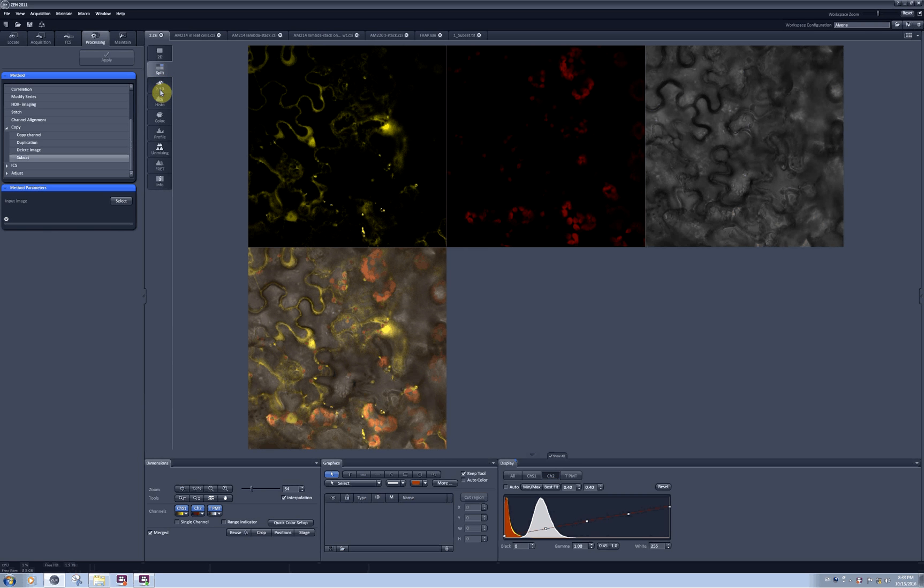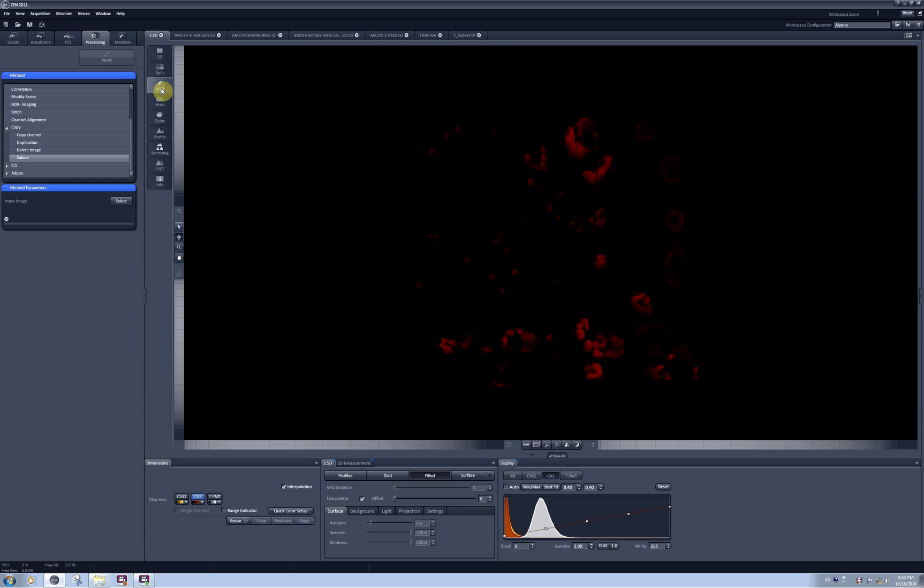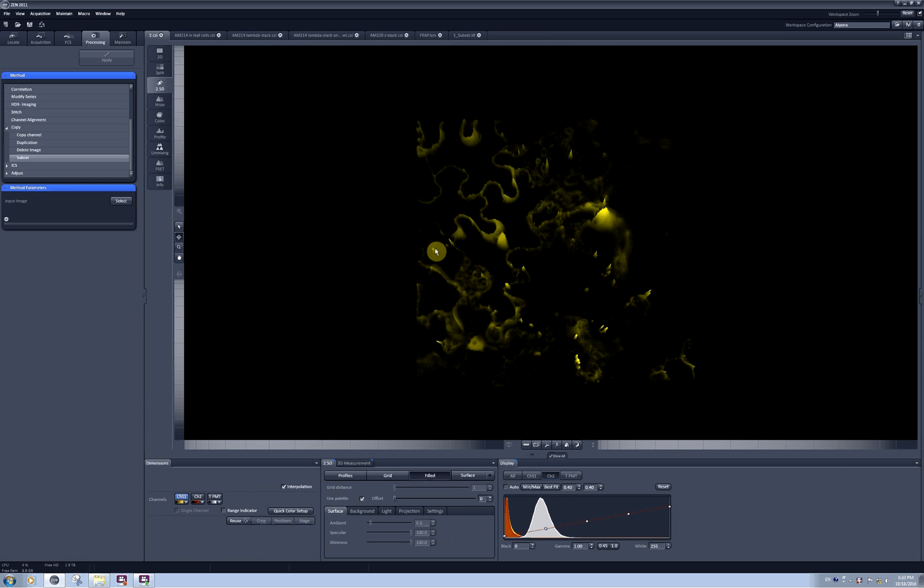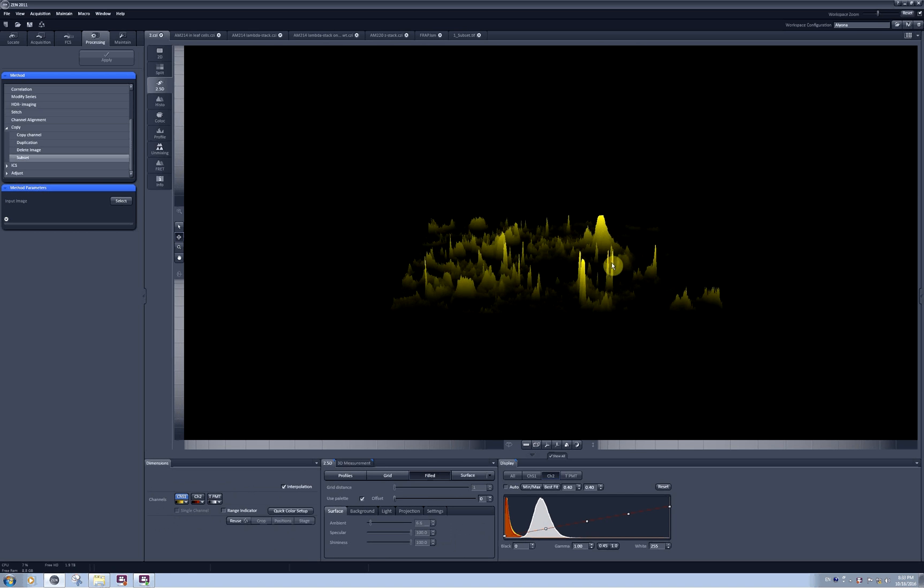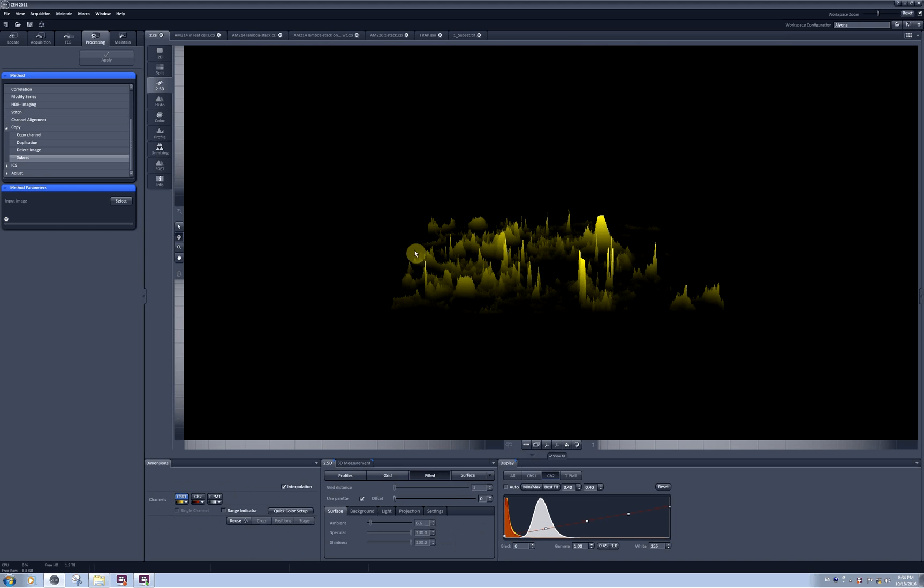The next tab offers you a function called 2.5D. In this tab, you can plot your intensities as a third dimension, the z-axis. You have the y-axis for coordinates of your pixels and the z-axis for plotting intensities.